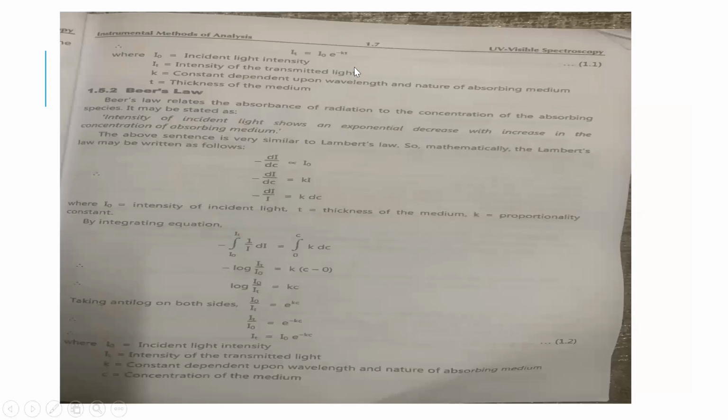On integrating this equation, we get minus log It by I0 is equal to K into t. Finally, this equation can be written as It by I0 is equal to e to the power minus kt. So this is the final Lambert's law.